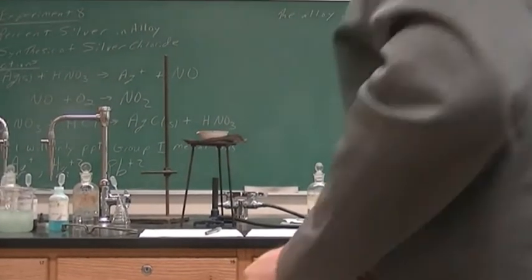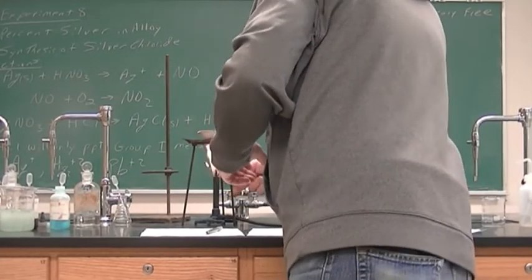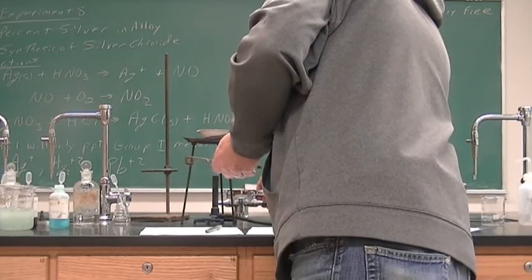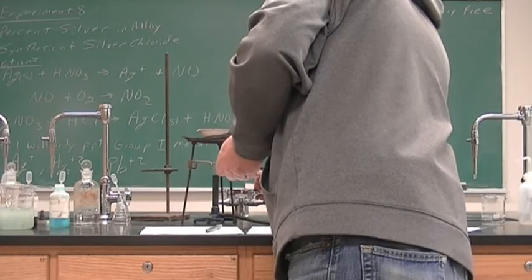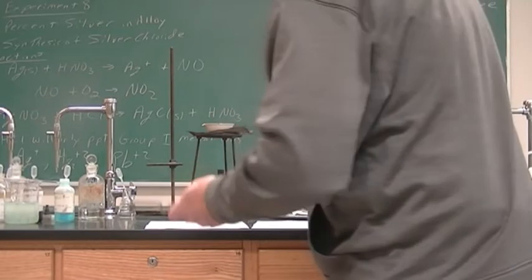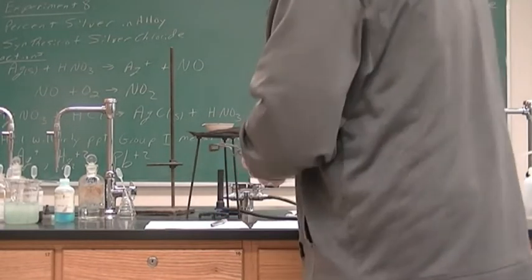All right, let's back up again. You want to heat this gently.